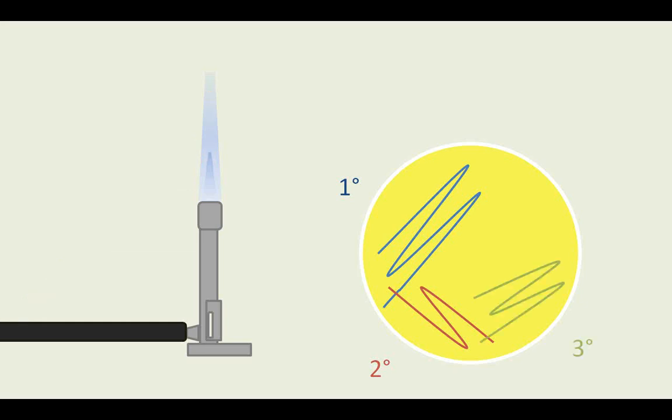Continue in this way a third and fourth time, drawing from the end of the previous streak onto a new part of the plate, making sure to flame the loop between streaks.